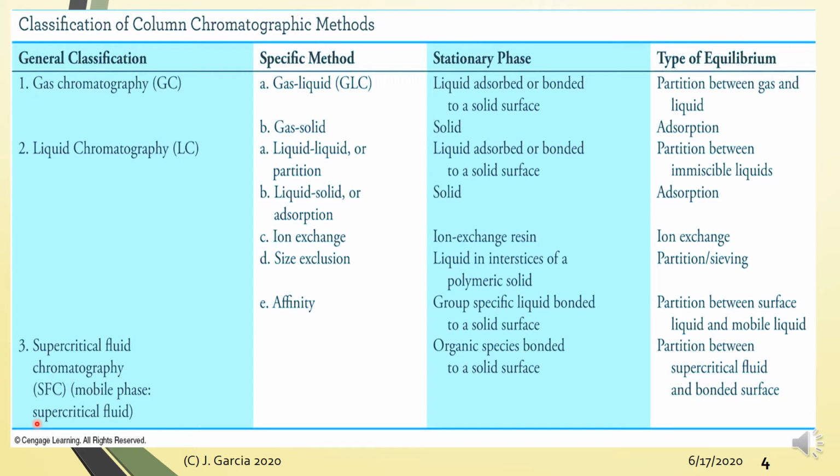Because in liquid chromatography, one problem is that you produce a lot of waste, the spent mobile phases, which are mostly organic solvents. That adds expenses to the laboratory to dispose of those chemicals. Whereas for supercritical fluid chromatography, your waste is just carbon dioxide gas, so it just flies off into the air.